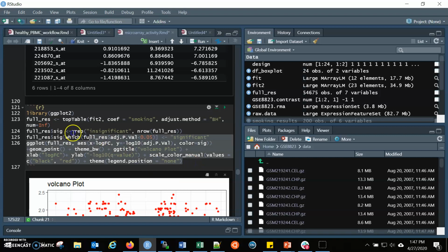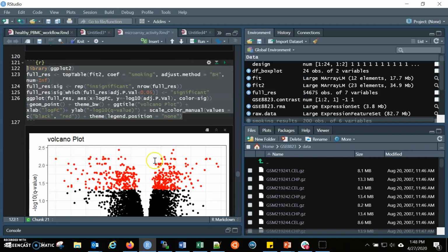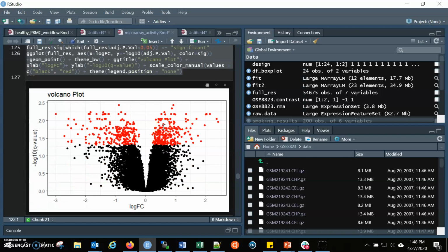So we have this long code chunk here, and first we load a library called ggplot2, which is a very popular library that is designed for data visualization. We're not going to get into everything that this particular code chunk means. I'll upload my R notebook of these commands for you to enter in, to make it a little easier so you don't have to type all this out. But basically, we're now trying to identify specific trends within our data.